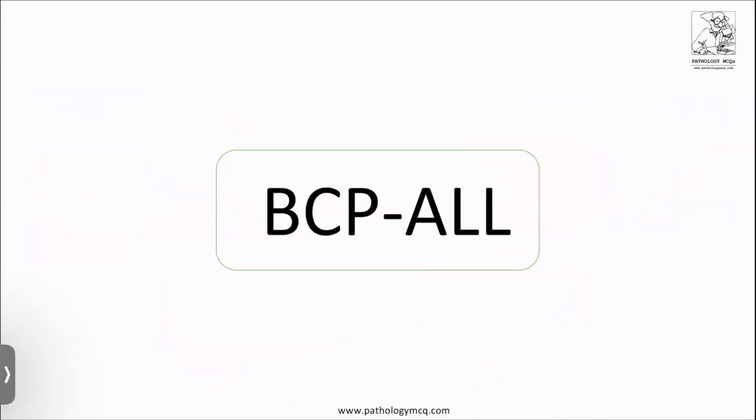Together, we can form a diagnosis of B cell precursor acute lymphoblastic leukemia.